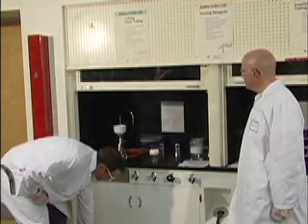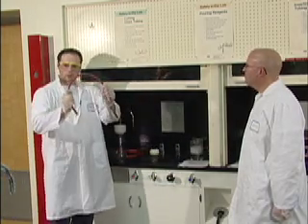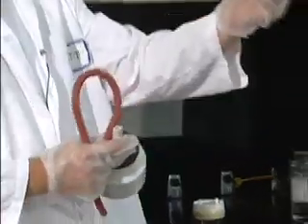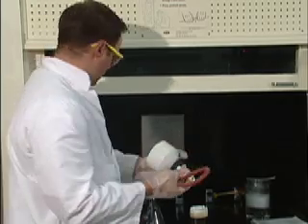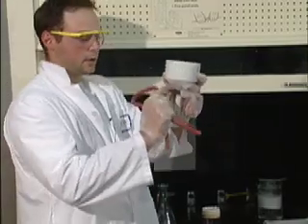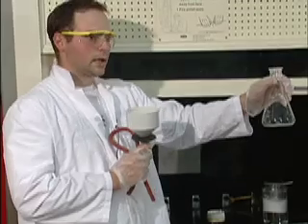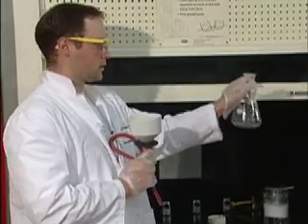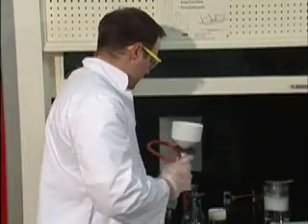Now, in the fume hood, you're going to grab 2 pieces of hose. You're going to grab a number 4 filter paper. Where do we get that? That'll be all on the side bench. Okay. You're going to grab a Buchner funnel, which is this white thing right here. You need the little O-ring for it, and a sidearm flask. As you can see, it's got a sidearm to it. Sidearm flask has a sidearm.